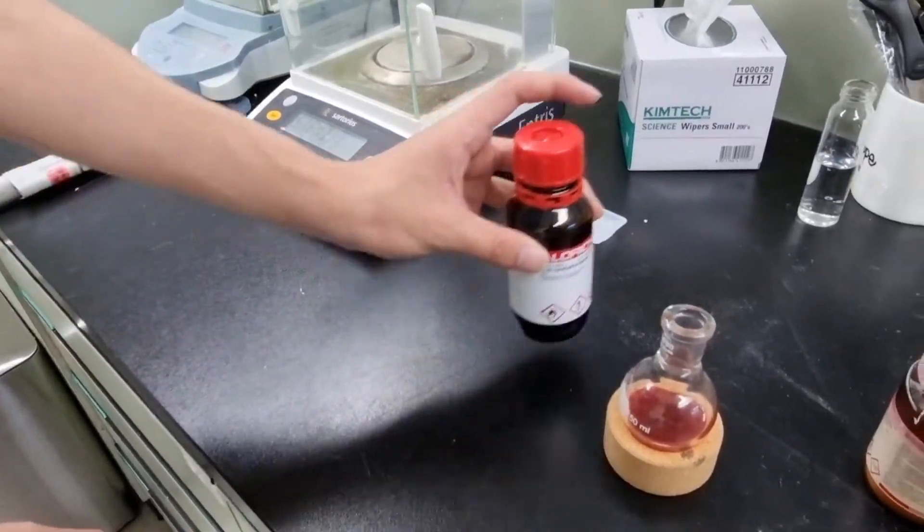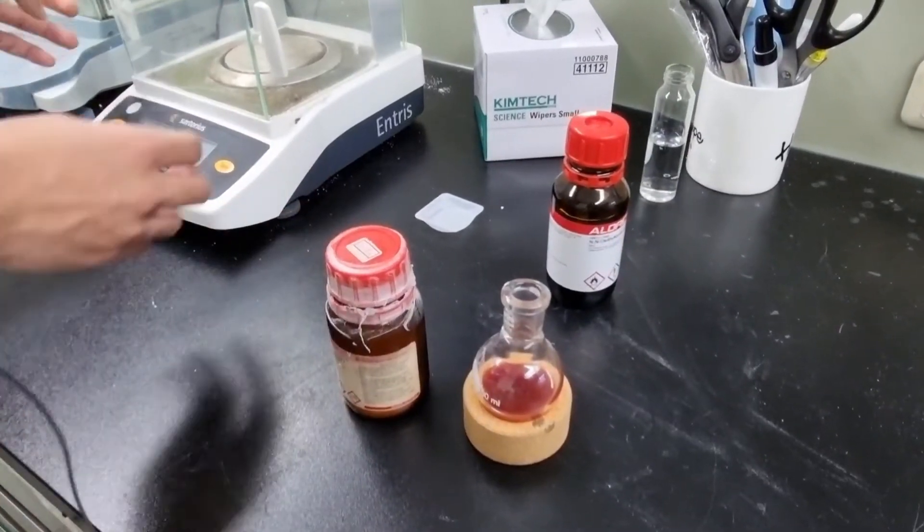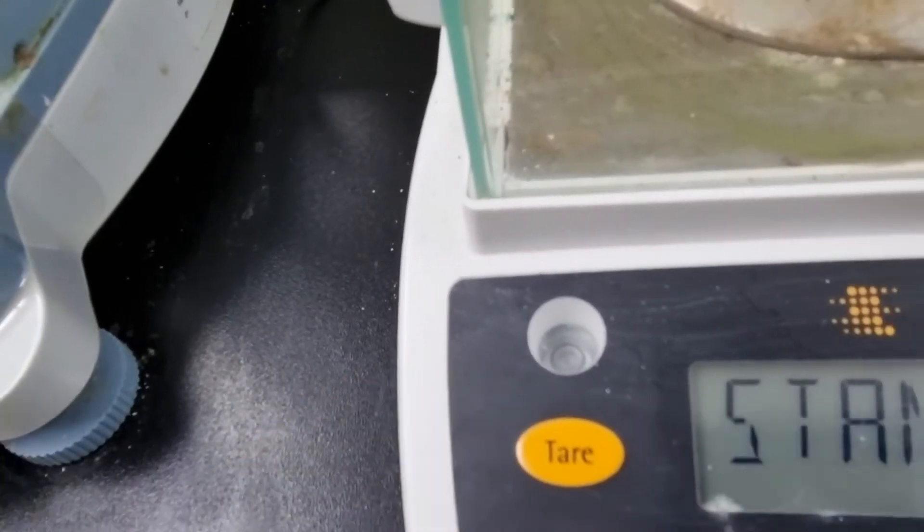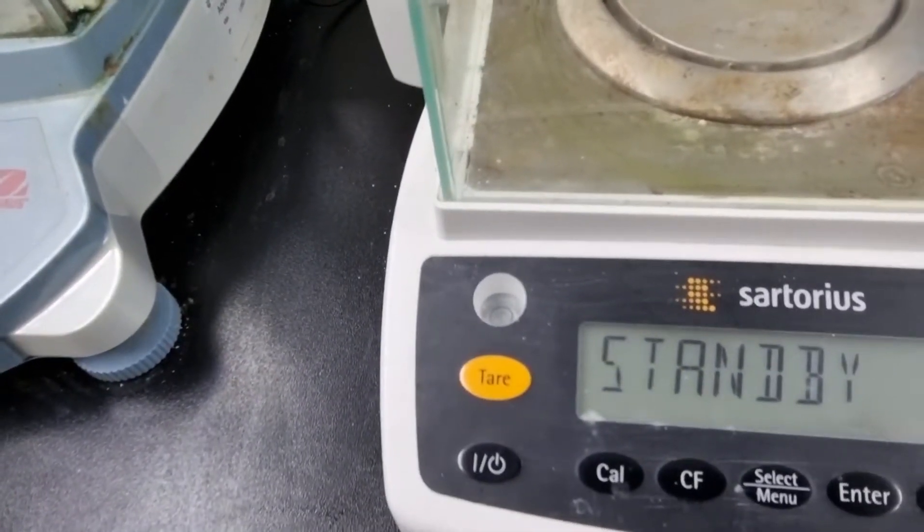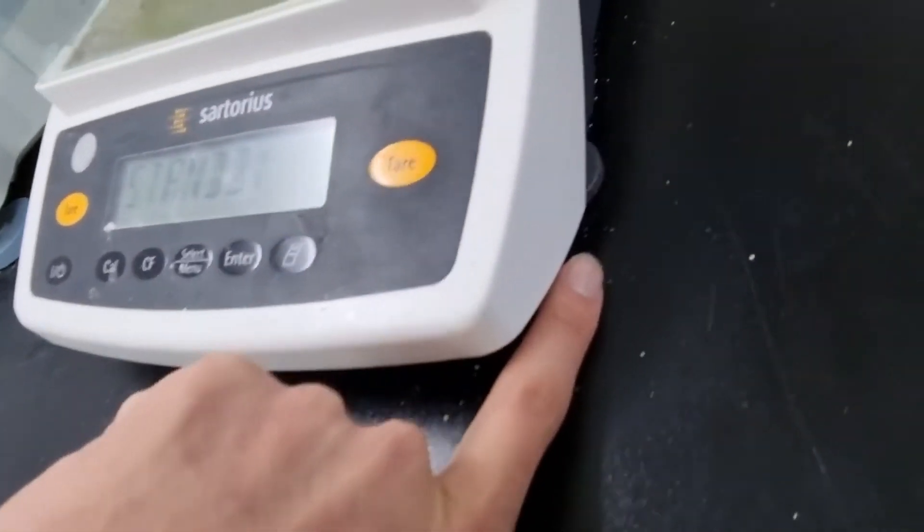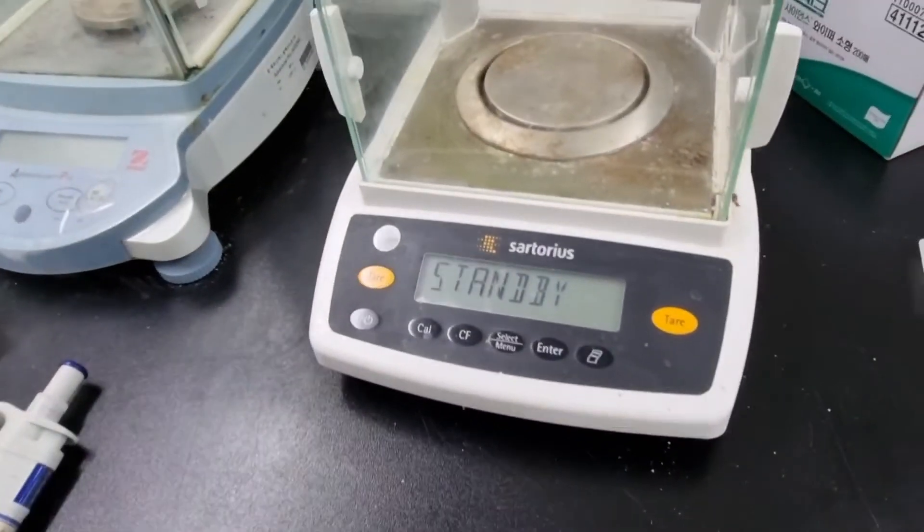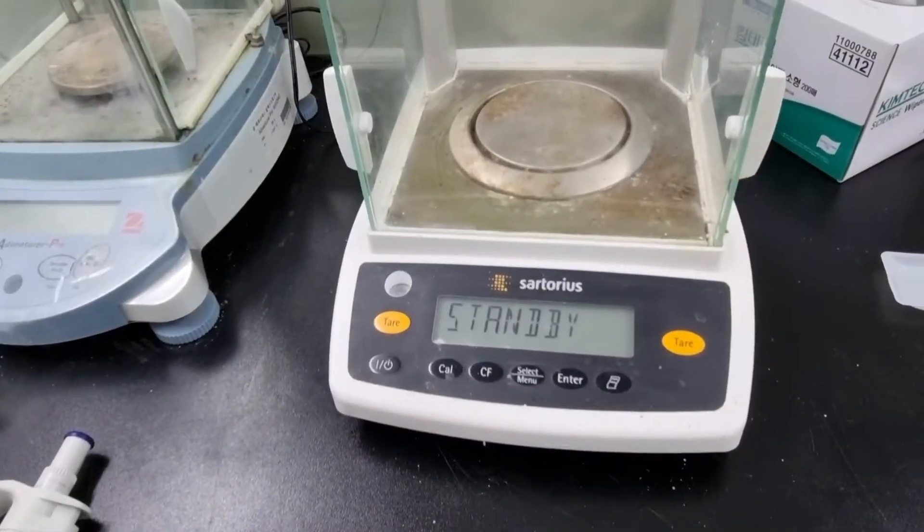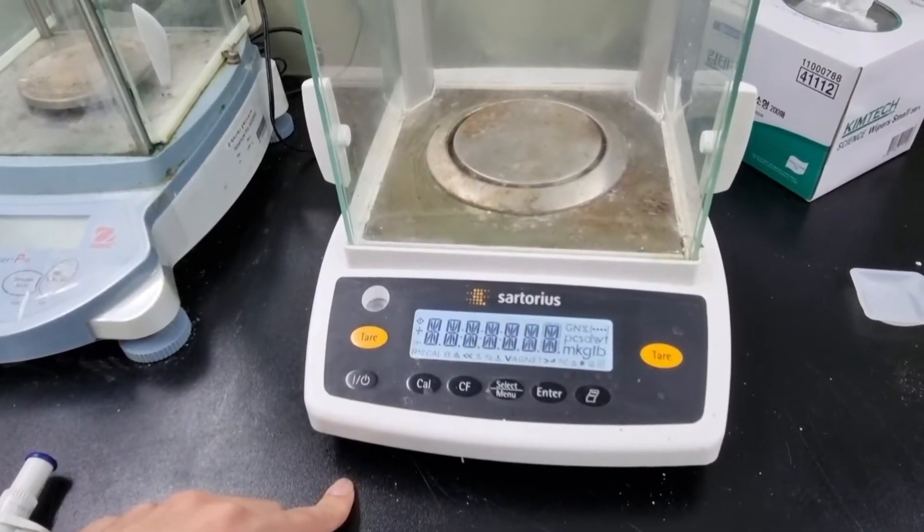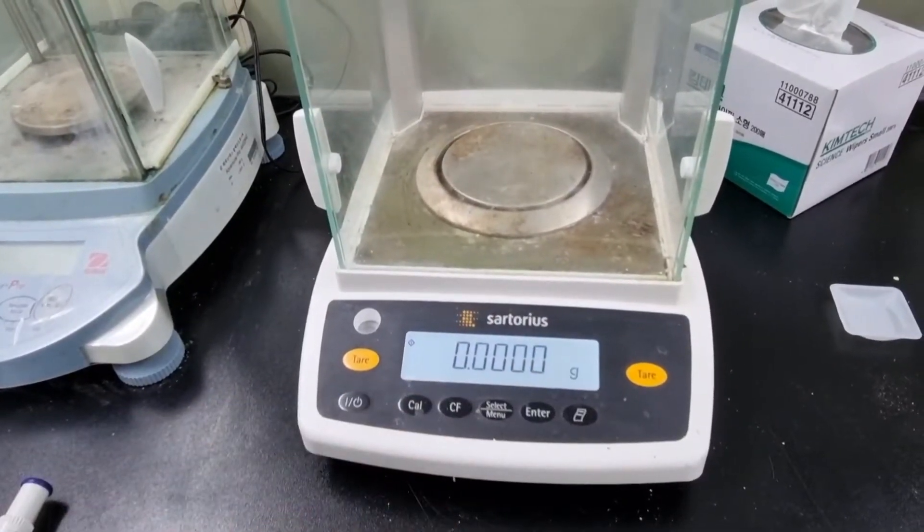So first, in order to weigh the metal salt, you must first set the balance. The round bubble is right at the center of the circle, so you can see that it's set. If it isn't, you can rotate these legs at the bottom. So first you turn on the power, and you wait for the numbers to appear.